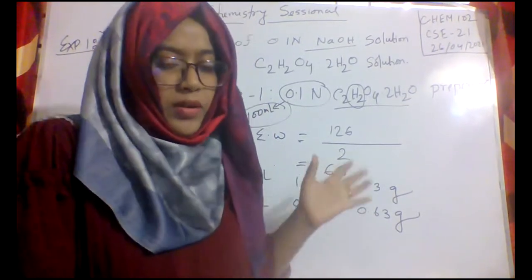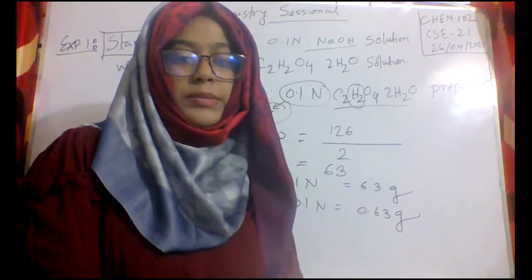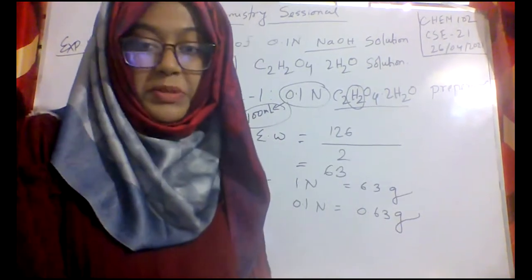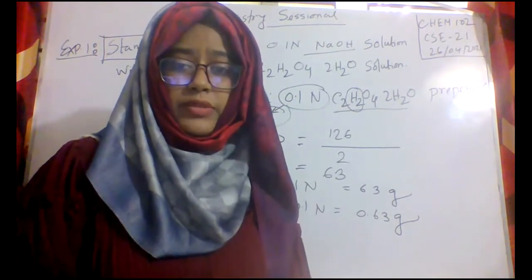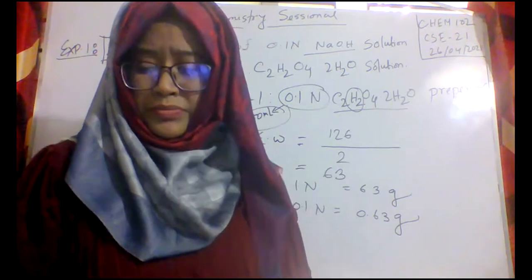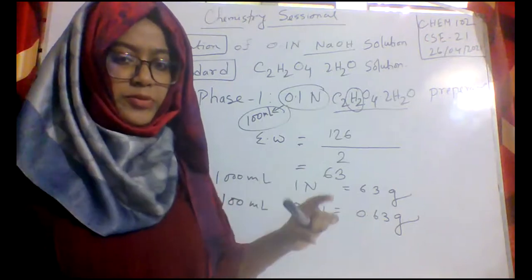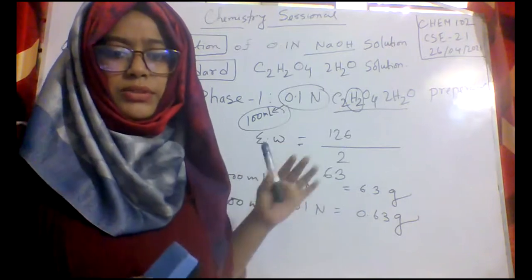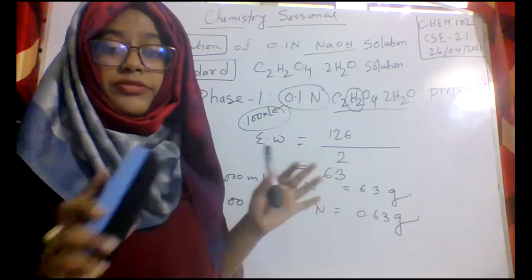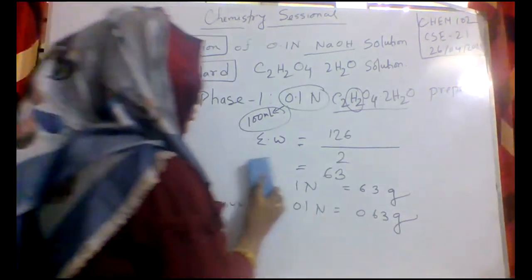So we have completed phase 2 also. Now come to the calculation part, or experimental data part. I have given you the PDF. In that PDF, you will find the format, how to write down the experimental data and how to calculate using V1S1. So I will just explain the mechanism of the phenolphthalein indicator, how it actually happens. Most of you become confused about this.